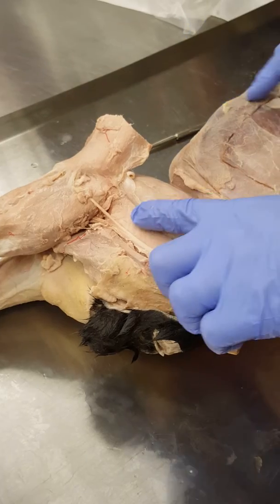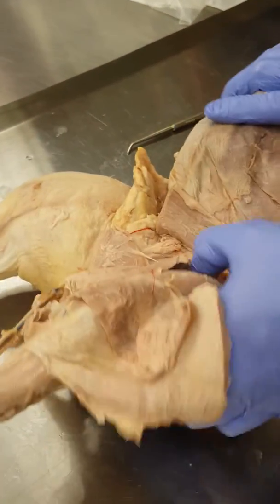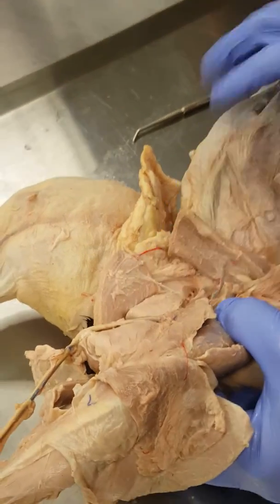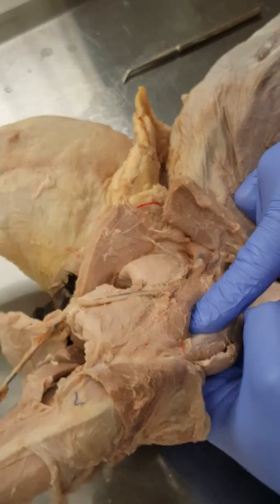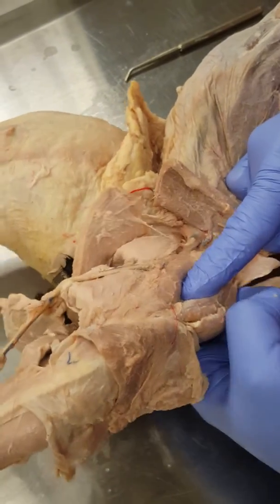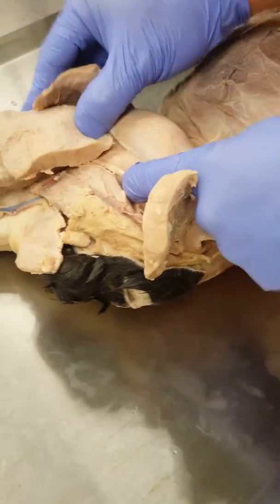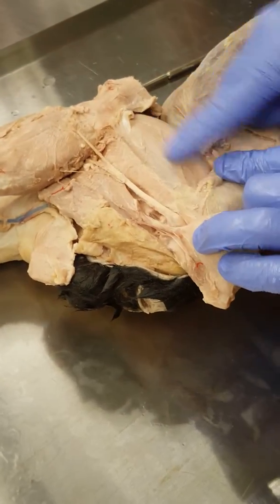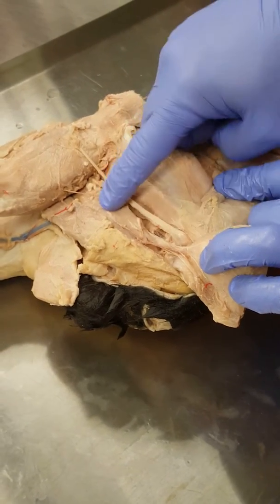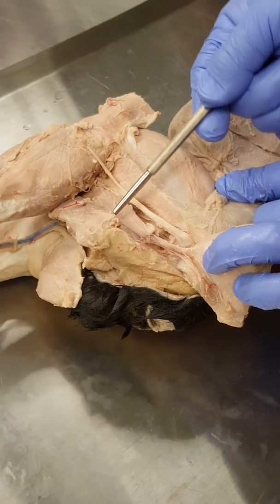So let me show you something. I'm going to put my finger on it, and I'm going to roll the leg over, and I'm just going to push with my finger, and watch the adductor. I don't know if you can see that I'm pushing up on it. See that? So that's the adductor muscle there, and I'm just going to roll the leg back over and look at what muscle I was pushing up on right here. That's the adductor. So it's vastus lateralis, then the adductor, then the semimembranosus right there, and again, semitendinosus.